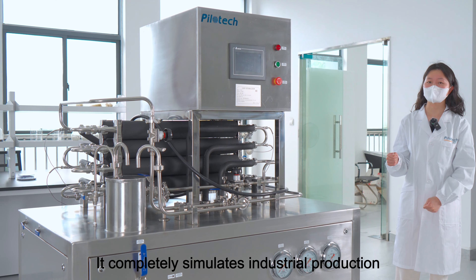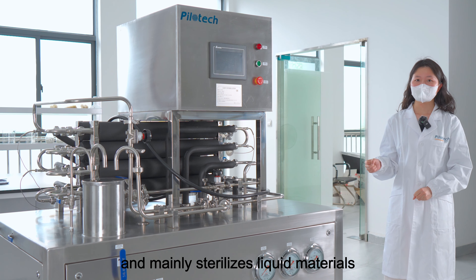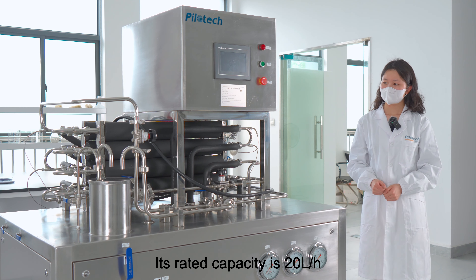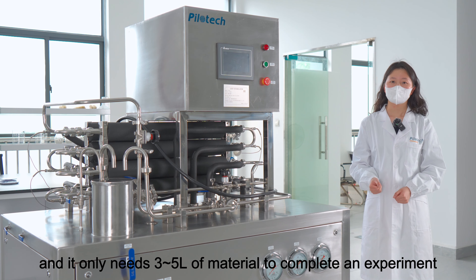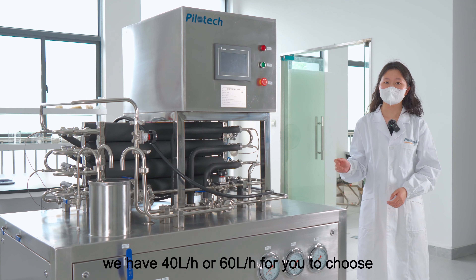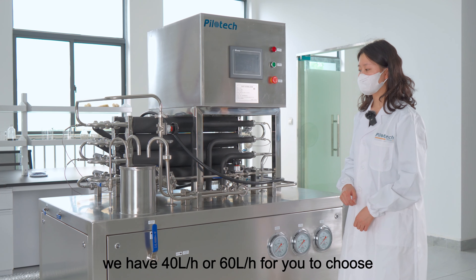It completely simulates industrial production and mainly sterilizes liquid materials such as beverages, fruit juices, and dairy products. Its rated capacity is 20 liters per hour and it only needs 3 to 5 liters of material to complete an experiment. If you need a larger capacity, we have 40 liters per hour or 60 liters per hour for you to choose.